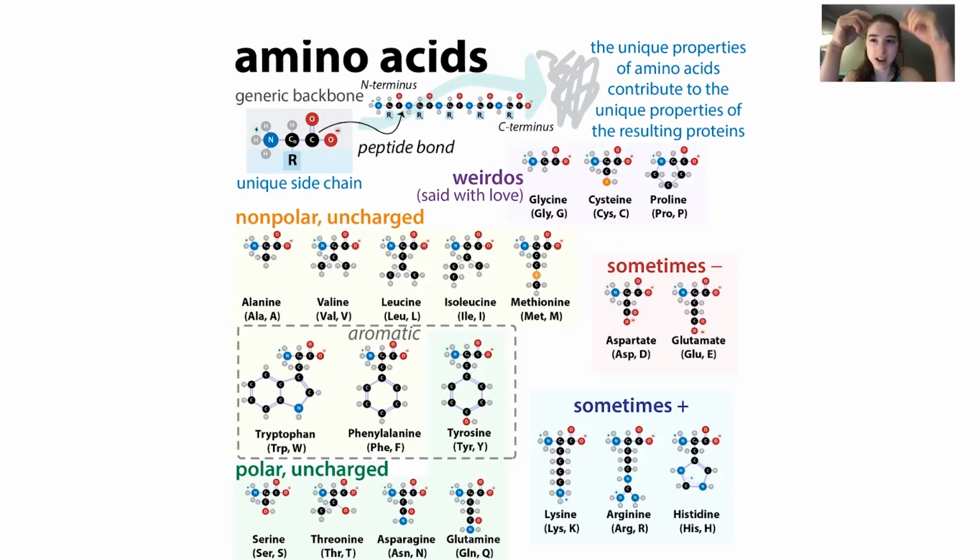But displacement factor is more technically accurate, because it could just be stuck in different positions instead of moving between them. Then you have things like occupancy, which I'm not going to go into. But basically there's this thing called B factor, and the higher the B factor, the less certain we are about the position of that actual thing.